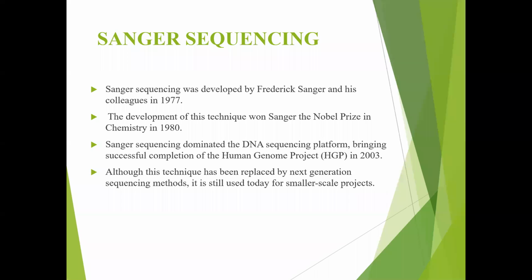The development of this Sanger's dideoxy method had a very major role in the completion of the Human Genome Project also, because there the major sequencing was carried out by this principle, that is Sanger's dideoxy method. Though the original principle has been replaced by next generation sequencing methods, this remains the primary basic technique even today in many smaller scale projects.